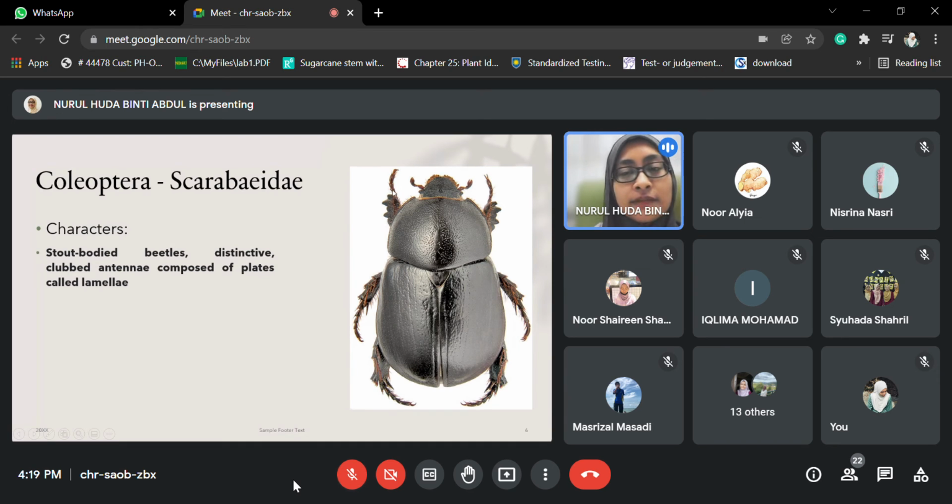Okay, it's just that of course since they're totally different insect, different order of insect, of course kaki dia tak serupa lah kan, tak adalah 100% serupa macam mole cricket. But yes, dia punya tibia here, as you can see here, this is a part of tibia. There are femur yang tersembunyi somewhere below dia punya prothorax. Okay. Kamu nampak dia macam ni sebabnya dia punya tibia is modified for digging.